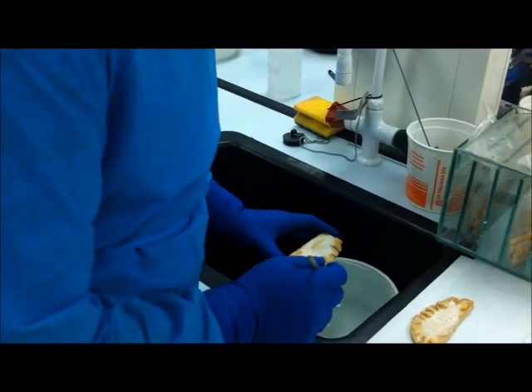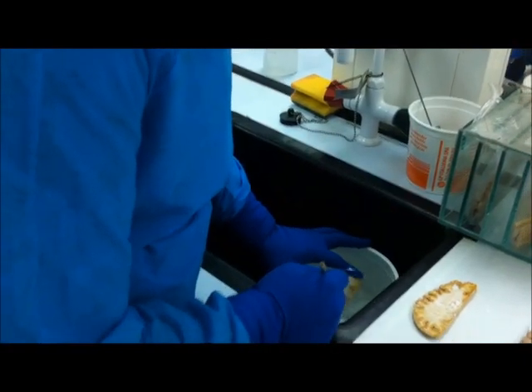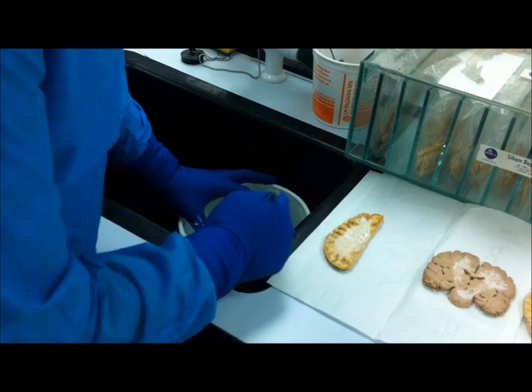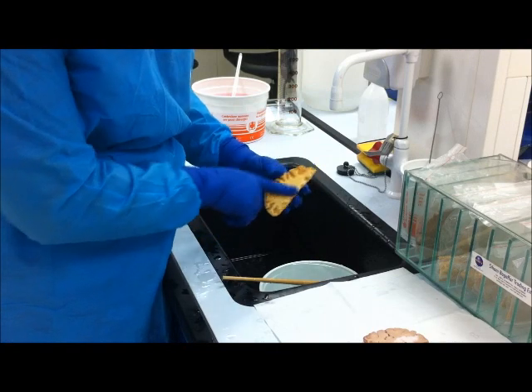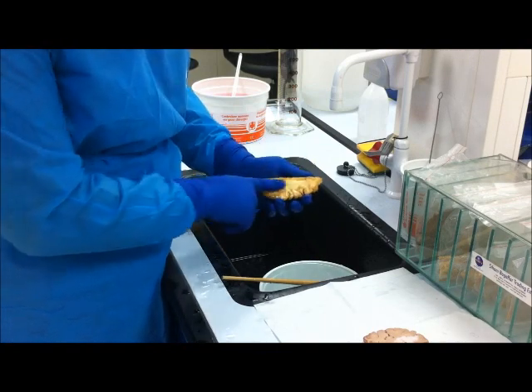Now we start by submerging the brain slice under a bathtub — just give it a little bath. And with a big brush, we have to remove all the crystallization off the brain slice. Now we have a very smooth brain surface. We can see how all the crystallization is gone.